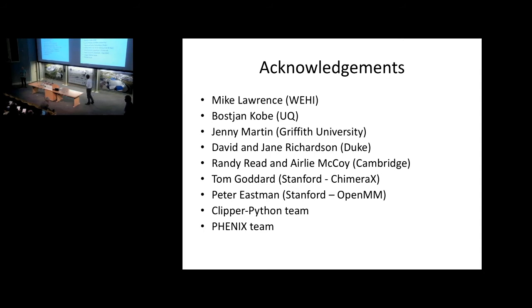I mean, there are many other things you can do, and there are many other things I eventually would like to try. One of the things that I've been really keen to do is to make a lot more use of what the MD is actually doing underneath. It's calculating all the forces through every atom. So why can't I take these and actually use them to do a stress analysis on the protein and see the regions that are actually under stress? That is something I think could actually turn out to be very powerful.